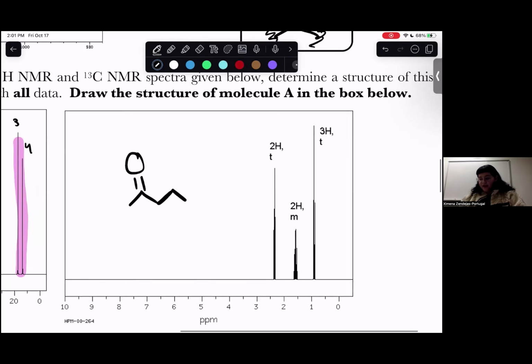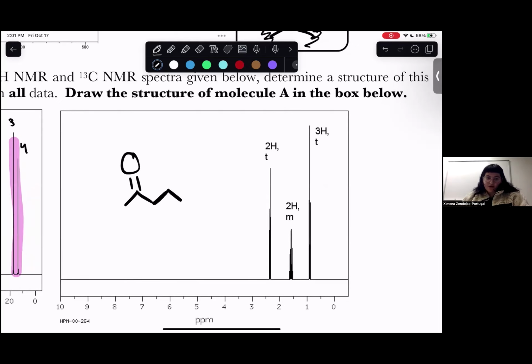And here we're going to apply that the hydrogen peaks also verify this. By applying the hydrogen peaks to each carbon, we can see that this first one, the most deshielded one, to the leftmost part of our graph, is going to be the one closest to the oxygen double bond. And it says we have 2 hydrogens on there, so we can put those 2 there.